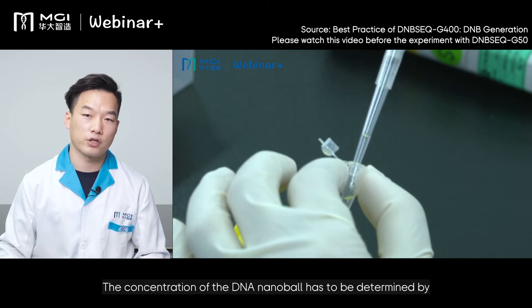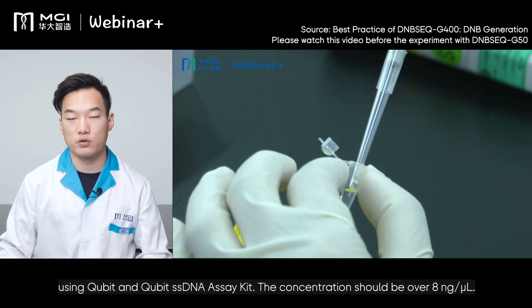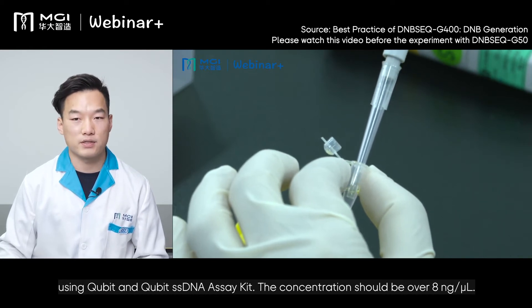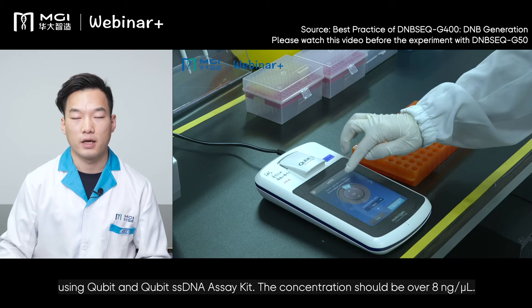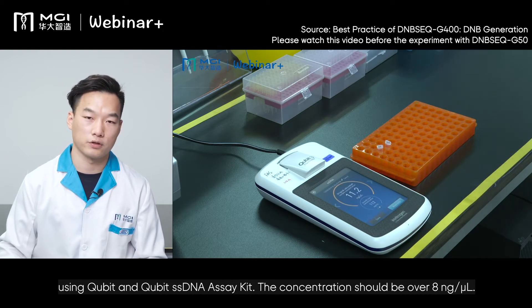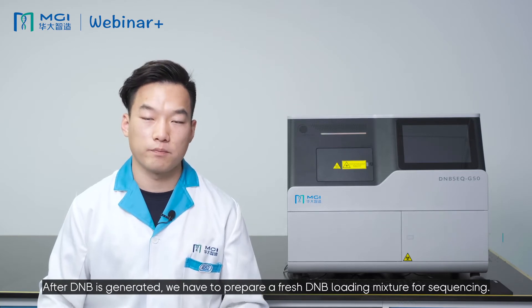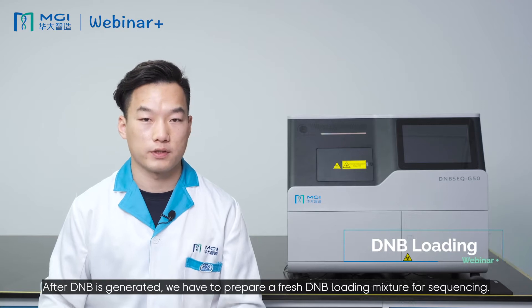The concentration of the DNB has to be determined using a Qubit and Qubit ssDNA assay kit, and the concentration should be over 8 nanograms per microliter. After DNB is generated, we have to prepare a fresh DNB loading mixture for sequencing.